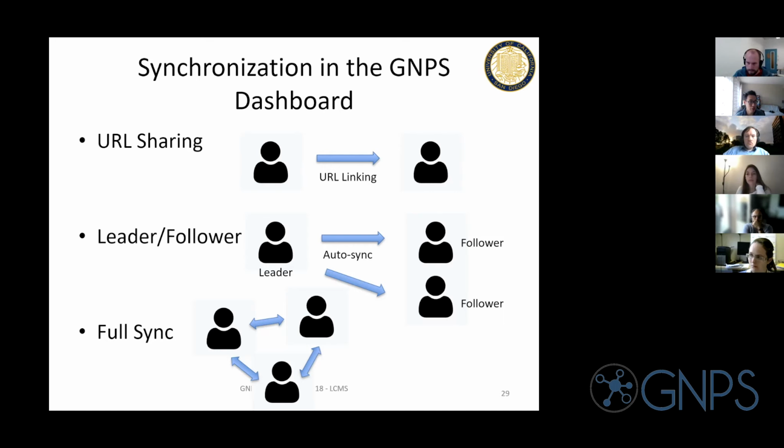I think there's a lot of really good software that you can run on your own computers, both vendor as well as open source, that can accomplish what we've shown you in terms of navigating around data to the same extent or better. But because it's centralized and web-based, we're able to enable you to interact with the data, your data or public data, customize the visualization that you want, and then easily share it with others.